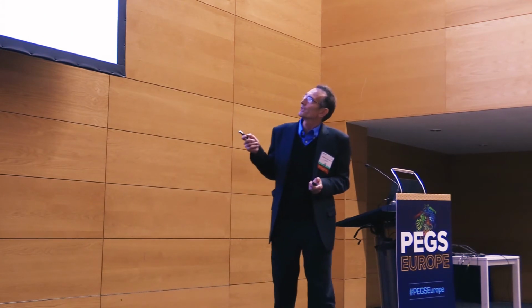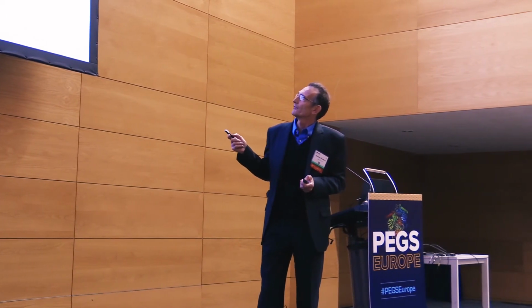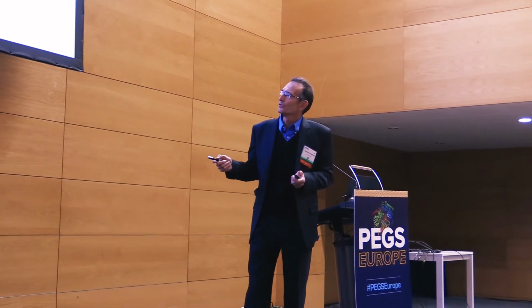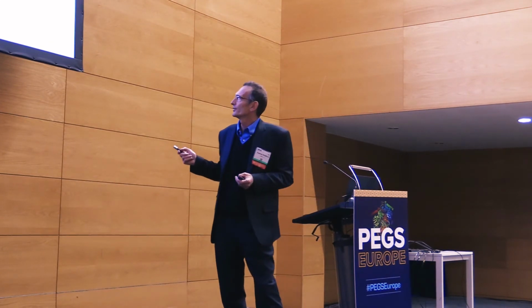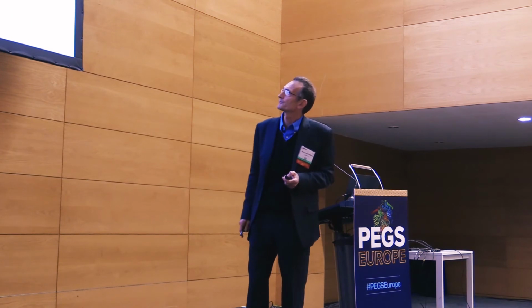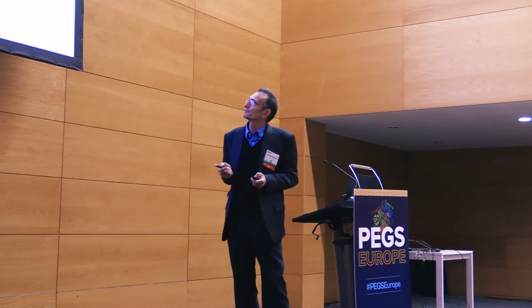So what we do is we take these amplified fragments for VL and VH. We assemble into VL and VH. We then assemble these into a single chain. And then these are either used for display in yeast to look at the expression levels, or alternatively into the phage display vector for selection. This is merely for testing, and this is actually for selection. The theoretical diversity of this library is 10 to the 26, and it has 10 to the 10 transformants.